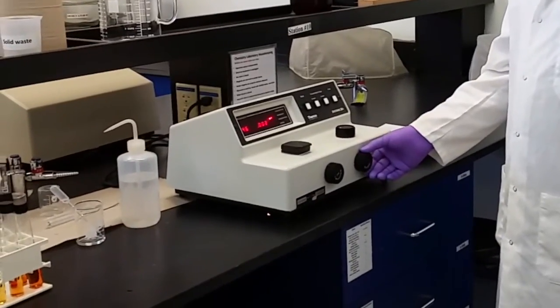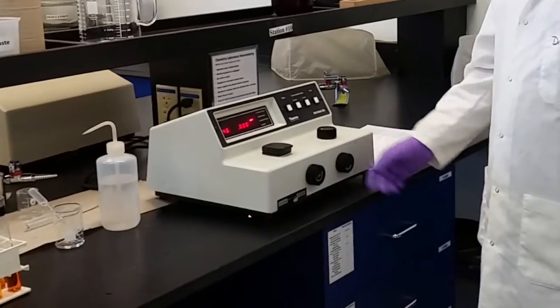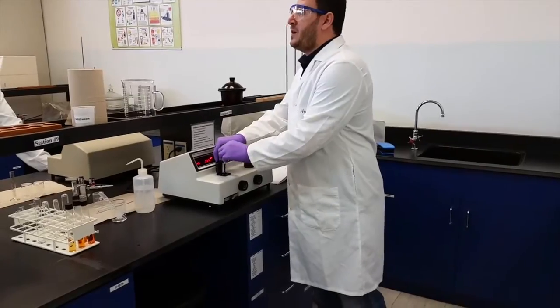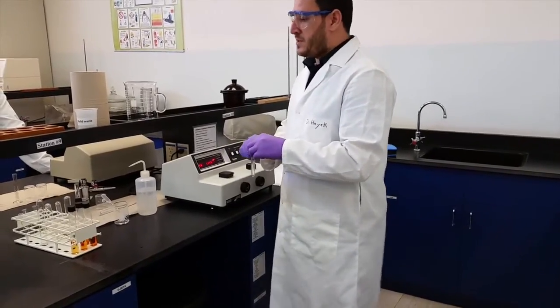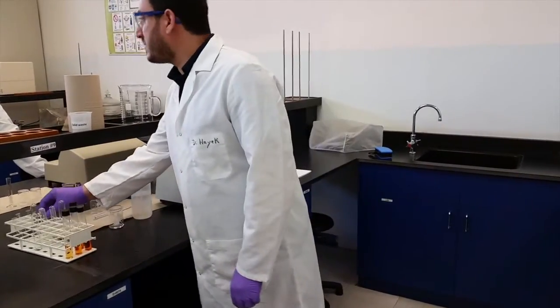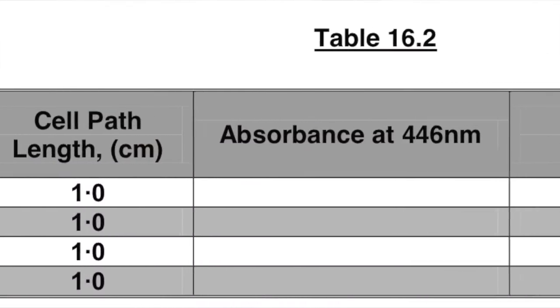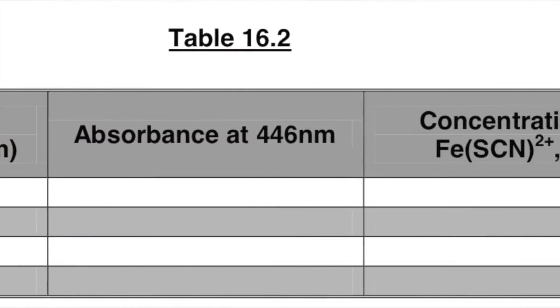I'll put it around 0, it doesn't matter much. In Investigation 1 you measured the transmittance. Now we will measure the absorbance, so you leave the mode to absorbance.